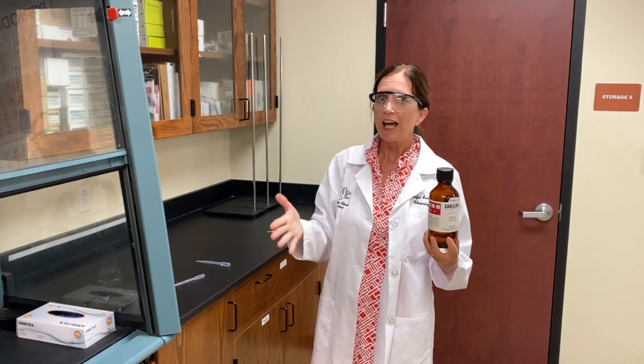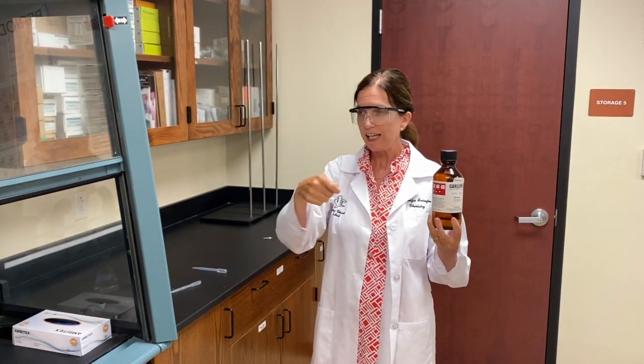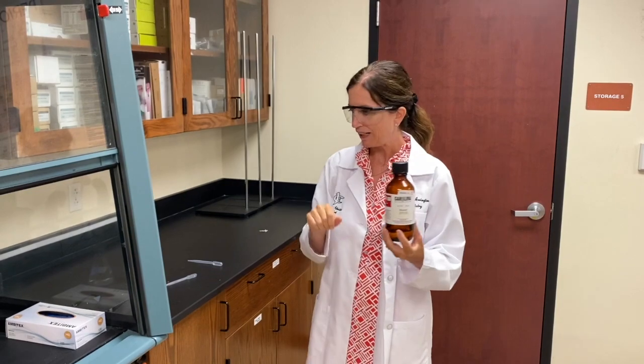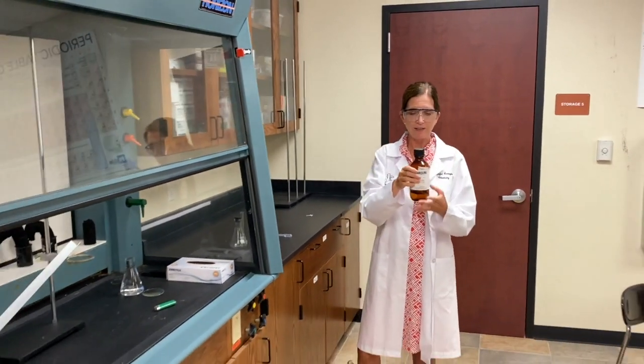What does that mean? That means if you're in the bathroom and you've got candles lit everywhere and you open a bottle of acetone — no bueno, and I'm about to show you why. So don't remove nail polish with candles around.